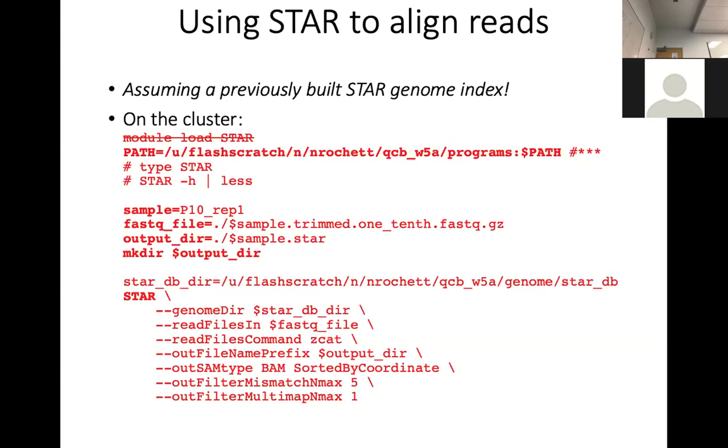So it's not like the path is twice. This thing there is what is actually seen by the program as an argument. So actually that is not an initial copy paste, you can't just do it like this.